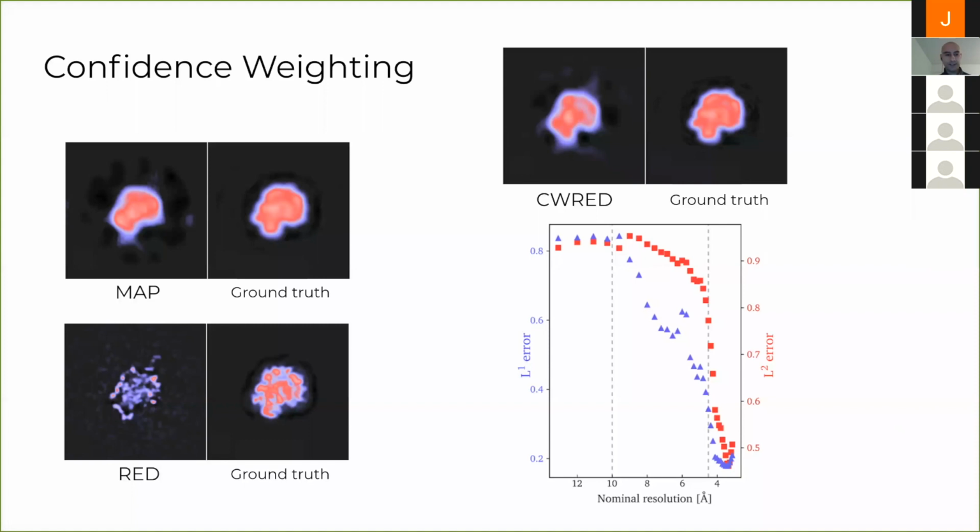And you can see in this specific, really difficult case that when using the regular Relion reconstruction, this is what you get, a very blobby looking thing, because the signal to noise ratio was very low. And if you low pass filter your ground truth to the same resolution, it looks similar.